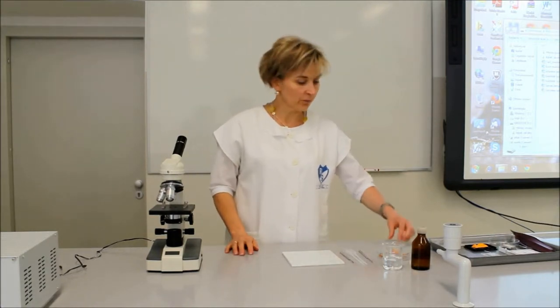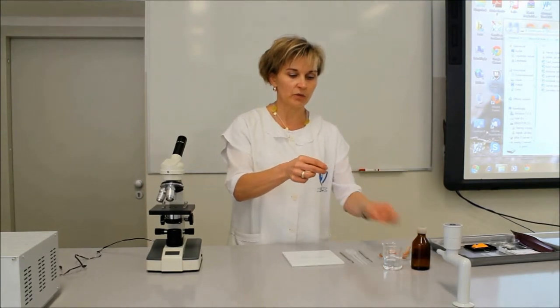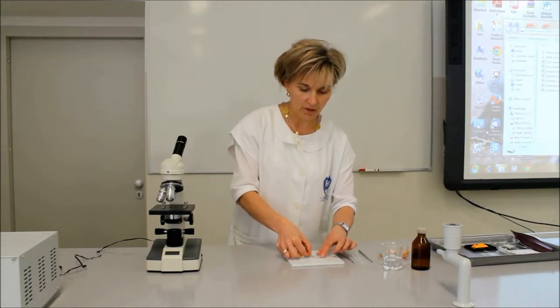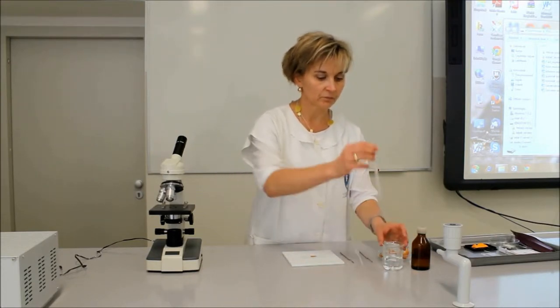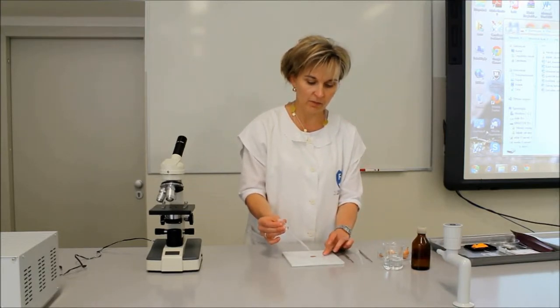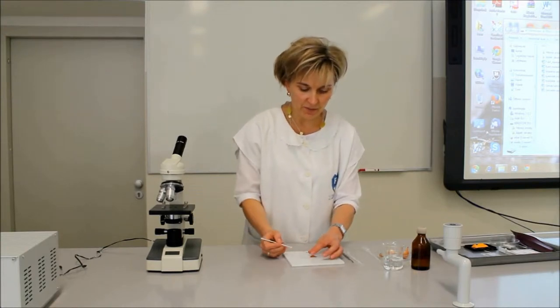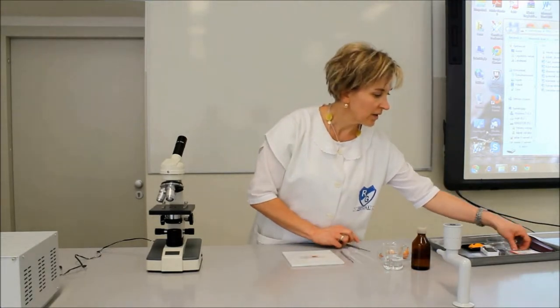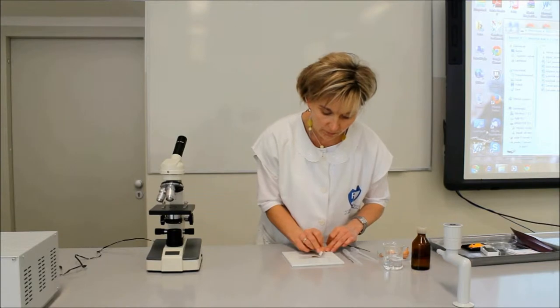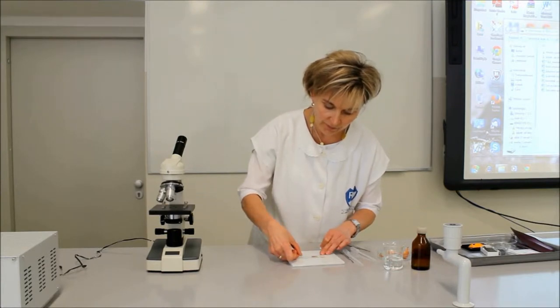For our experiment, we cut off a small piece from the scale leaf of the red onion, place it on the microscope slide, add a drop of water, and then cover it with a cover slip. Any remaining water is then absorbed with blotting paper.